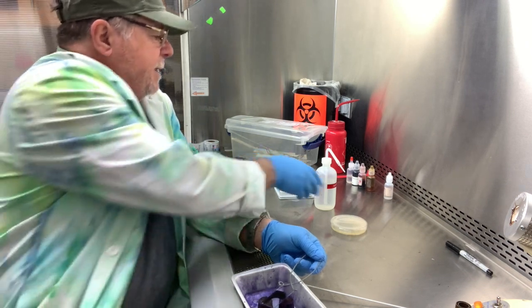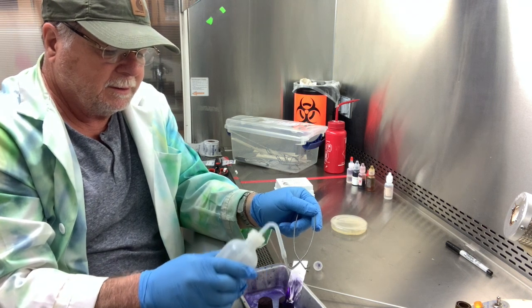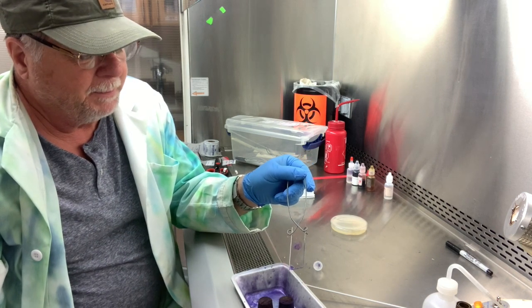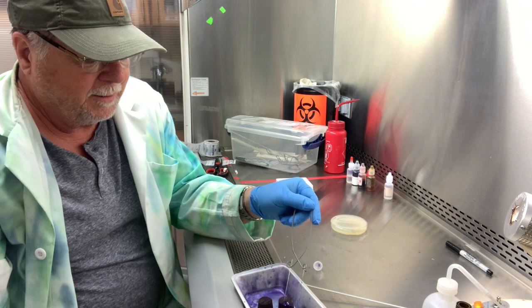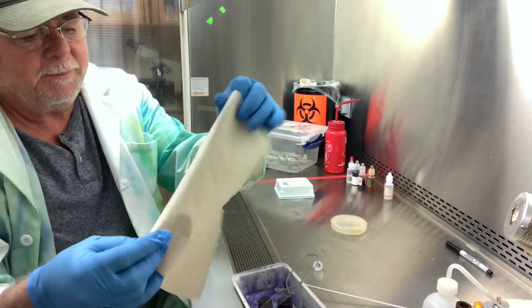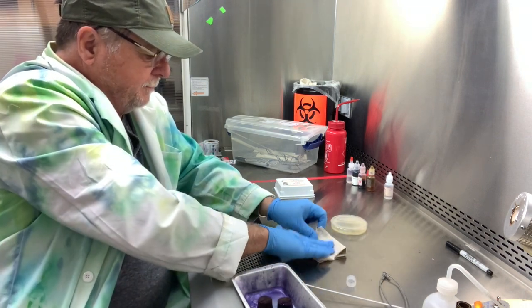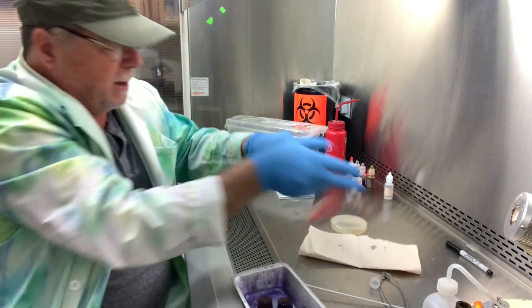So this is about 30 seconds, and then we're going to take our squirt bottle, angle this, and rinse it off. You don't want to do it too aggressively, but you want all the loose stain to be removed. And so now you can see this has a little bit of a purple haze to it where the smear was. That means there's probably bacteria there, and it's going to be stuck to that. All right, so the next step is to blot it dry. To blot it dry, we take the paper towel, fold it, set our slide in there, and we just tap it. We don't smear it, don't wipe it, we just tap it.